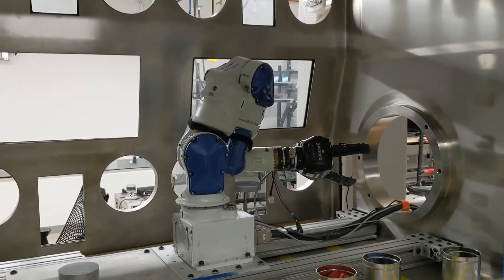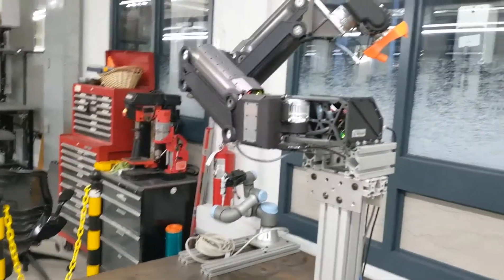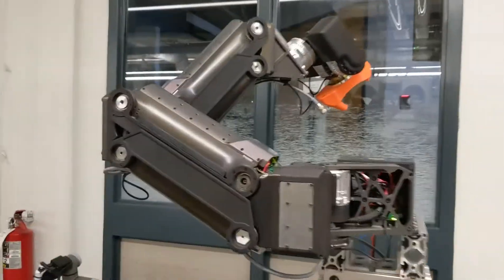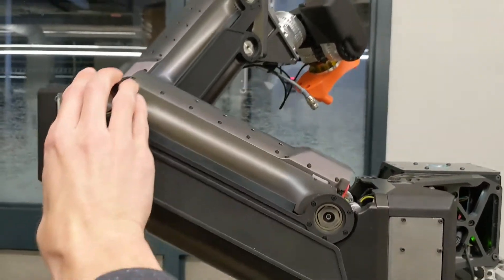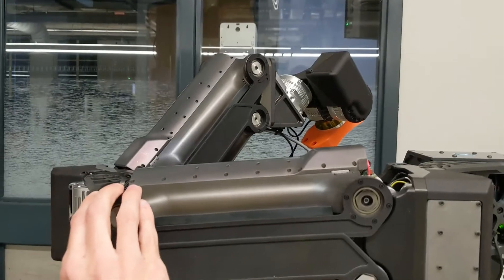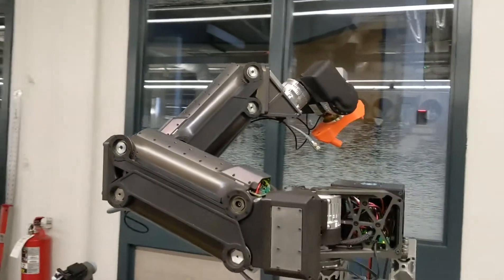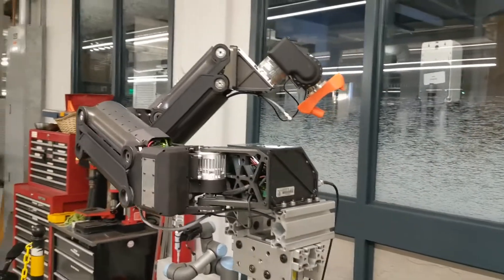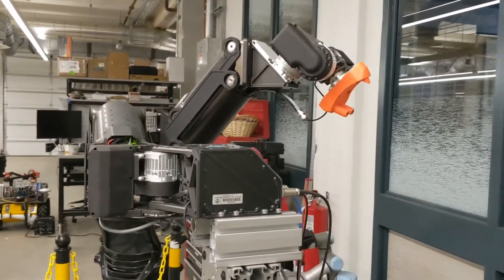However, you might see something like this assembling cars in an assembly line, but Scorpio is a little bit different. Most notably, it has these two parallelogram mechanisms with springs embedded inside them, and these springs stretch as the robot moves, which passively compensates for the weight of successive linkages and any given payload, and they can be dynamically set for a wide variety of payloads.